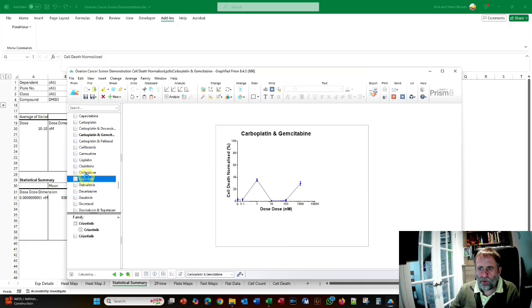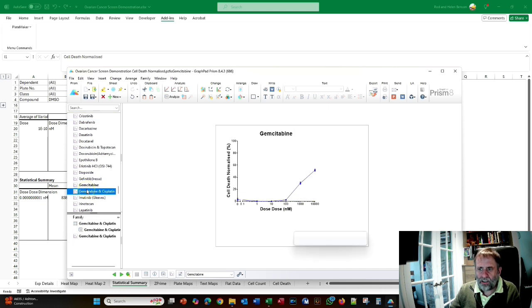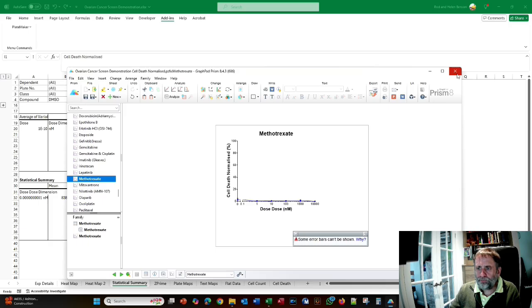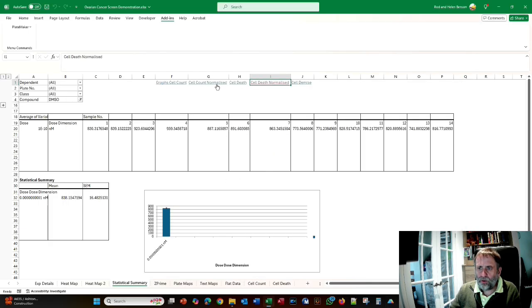We don't at this point have the necessary layouts, because I haven't used that particular template, but if I wanted to generate the layouts, I could. But you can see we can quickly step through and see all the different graphs it's generated. So that's the first thing, and by the way, that will work for every single one that's generated.